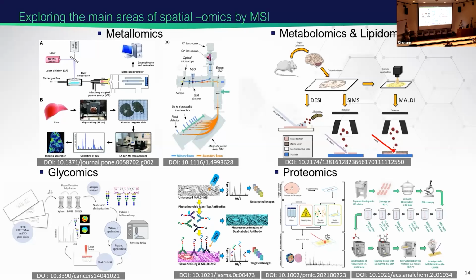And then we bridge into one of the more interesting fields to me right now, which is actually spatial proteomics. And there's a lot of techniques and technologies, whether we can do the in situ digestions with trypsin, Glu-C, different enzymes applied directly to the tissues that we can analyze these peptides coming directly off, or we can analyze the intact proteins themselves and actually see all the post-translational modifications, or do a targeted approach very reminiscent to immunohistochemistry, where we can actually take these probes and analyze them directly on tissue and then cleave off these peptides, which would be reminiscent and can form our ion images. So there's a very broad scope of any of this.